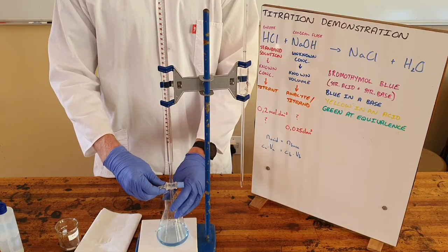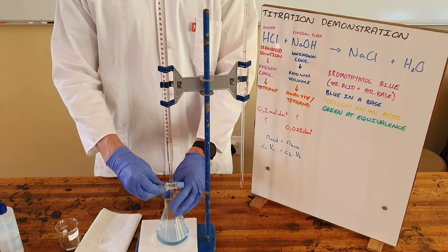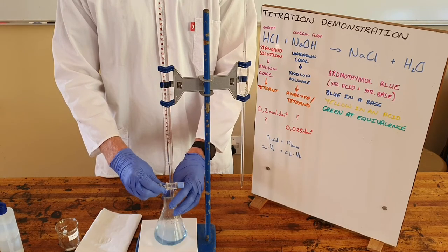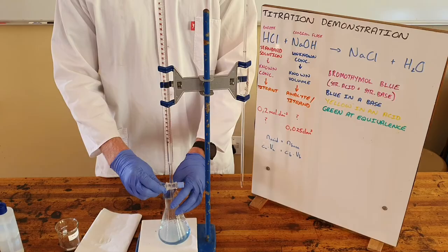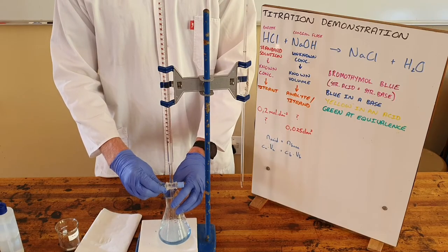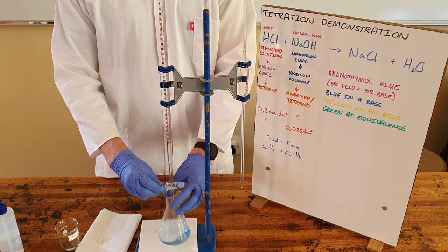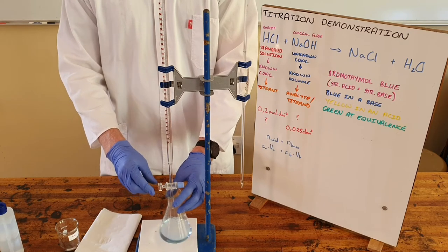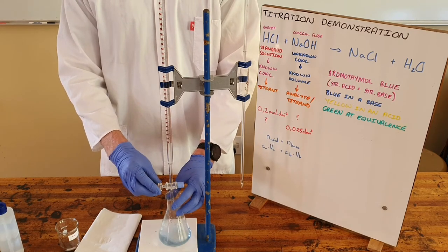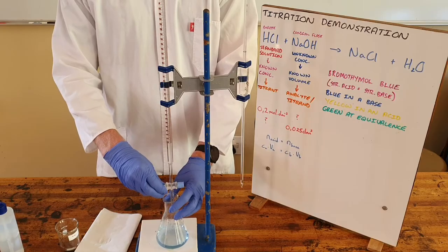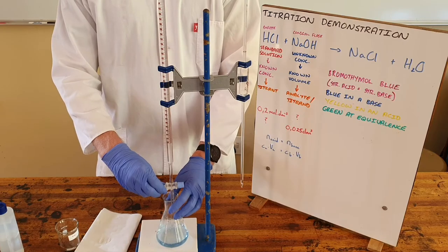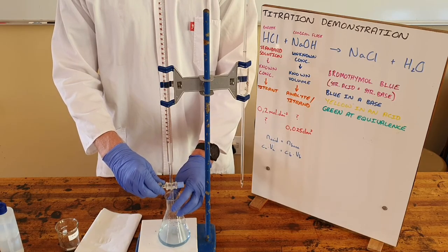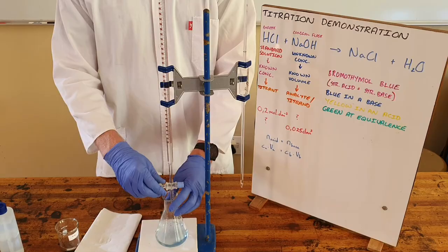So what we would do now is you would allow the titration to proceed slowly by opening the valve very slightly. You would always hold the valve in your strong hand while allowing your other hand to slowly allow the mixture to happen and as you get closer and closer to that expected equivalent point. I am now at 12.2. You would set the valve to drop the acid even slower.